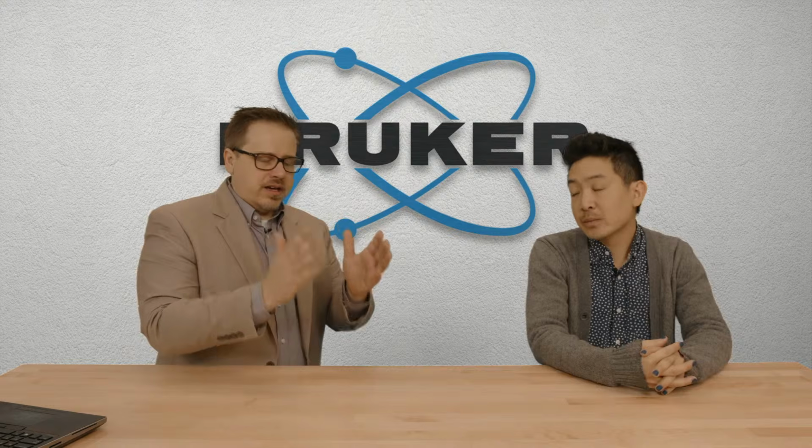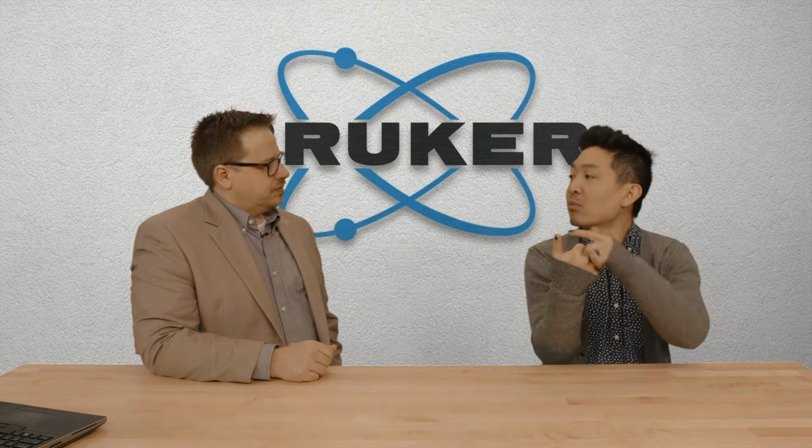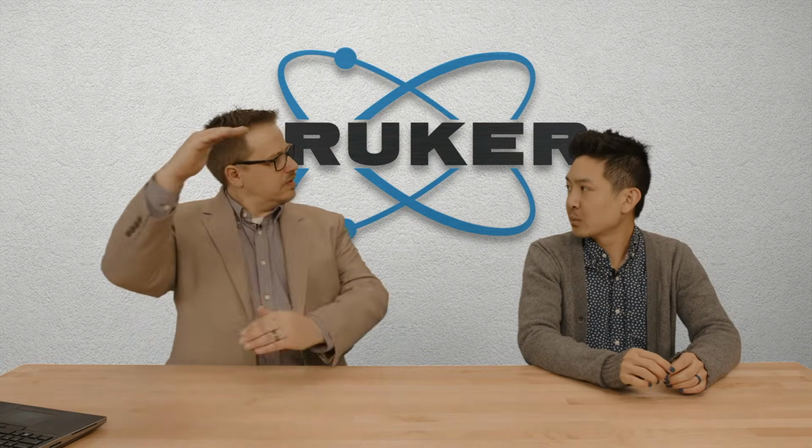And just to make that 100% clear to everybody out there, in XRD, it's not one peak is one phase. It's one set of peaks. I think you like to say it's kind of like a fingerprint. It's like a fingerprint, so you have many different ridges. You're actually going to be counting the number of fingerprints, not the number of lines on your fingerprint. What matters is not just the position, it also matters what the height of the peaks is within that pattern.